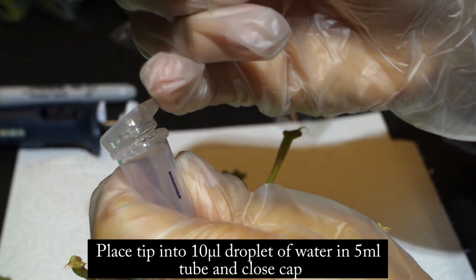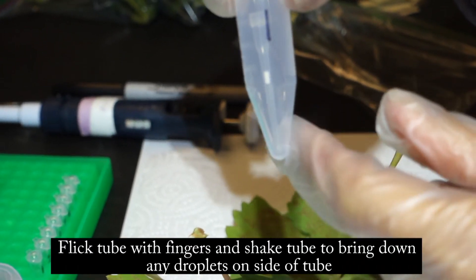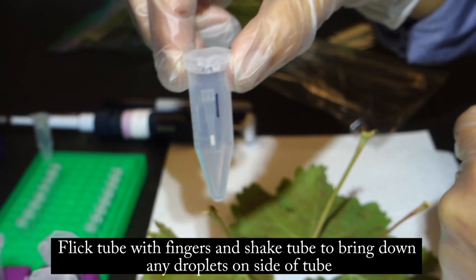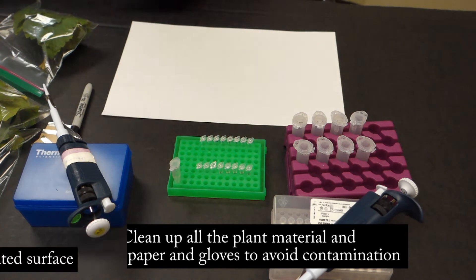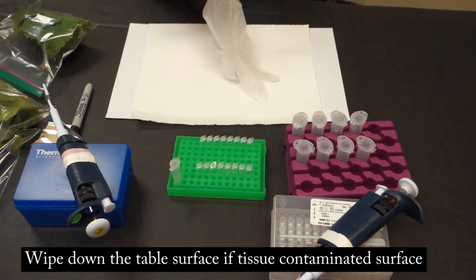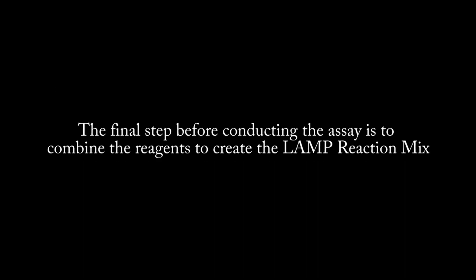Place the tip into the 10 microliter droplet of water in the 5 ml tube and close the cap. Flick the tube with your fingers and shake to bring down any droplets on the side. Clean up all of the plant material and change the paper and gloves to avoid cross-contamination. Wipe down the table surface if tissue has contaminated the surface. Repeat this process with plant samples 2, 3, and 4. Sample number 7 will contain no plant material, only the LAMP reaction mix and distilled water. Sample number 8 will contain only the LAMP reaction mix.